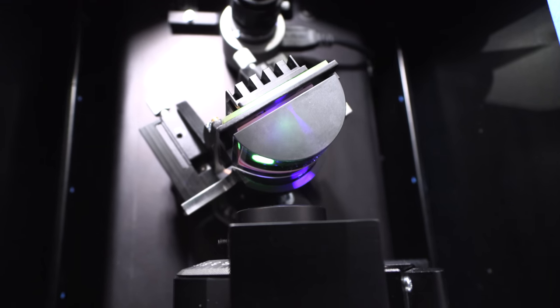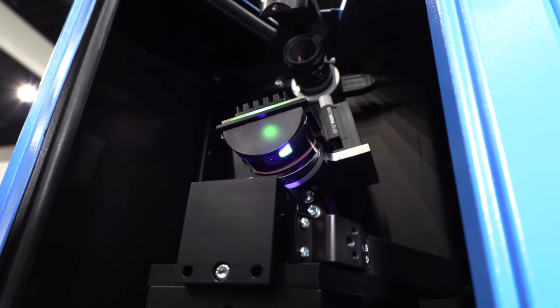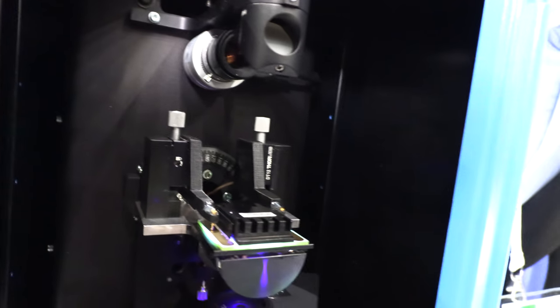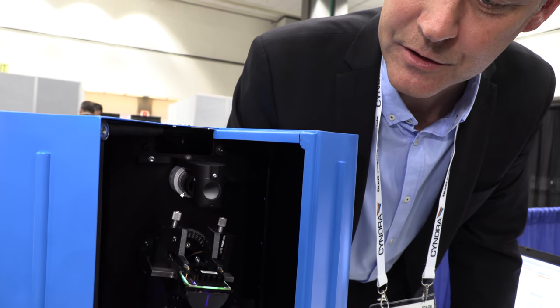So what are we looking at right now? That's the blue LED UV blue that you see exciting the organic film. The organic film emits green light. That would be the material in an OLED display of the green pixel material.